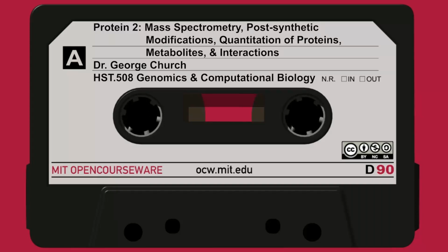And then we'll talk about some upstream separation methods. Before you fragment it into peptides, you can have dimensions on the proteins, which can tell you about the complexes. So let's go through a specific example of complexes.